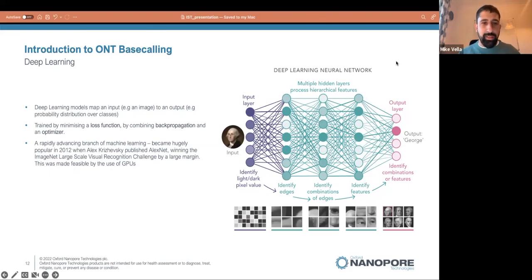And what you try and do in deep learning is, classically, you've got some kind of training data. So you've got some inputs and an output, which you'd like to map that input to. And using a technique called backpropagation, typically you run these on GPUs, which I'll cover in some more detail later. Using backpropagation, you show your network lots and lots of examples, and over time, through a process called training, you adjust the coefficients in your network. You parameterize your artificial neural network so that it more accurately over time maps the input to the output.